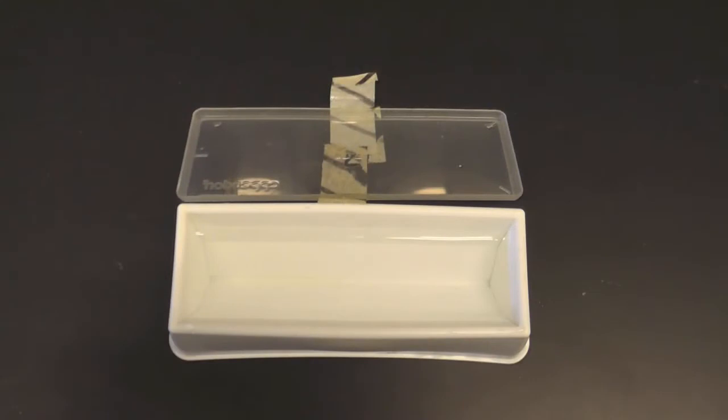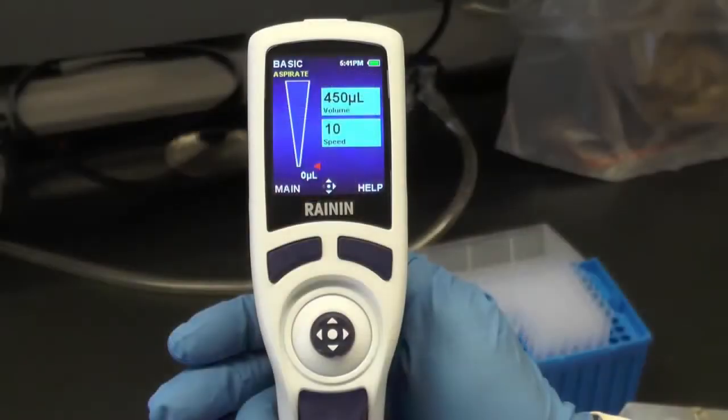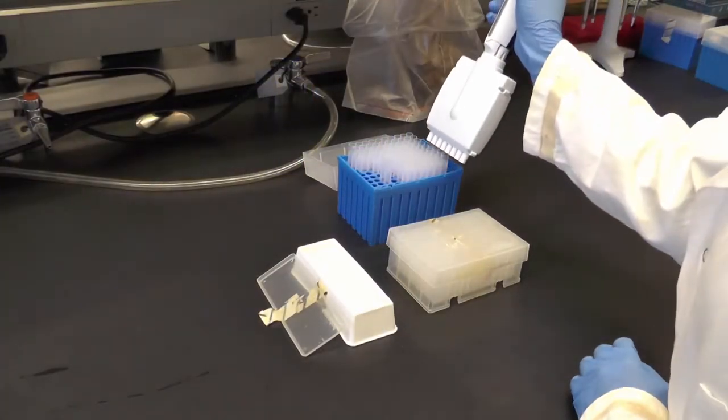First, you need to fill the wells in the megablock with your diluent. Pour enough diluent into a reservoir. Set a multi-channel pipette capable of holding your desired diluent volume to the proper amount and attach pipette tips to the pipette.